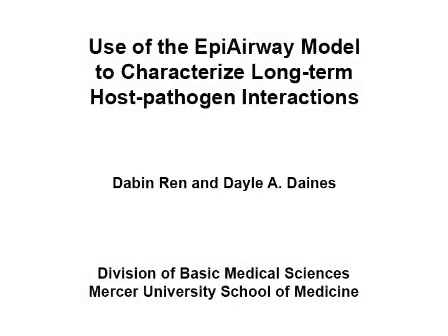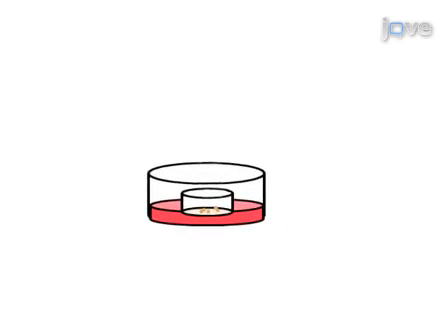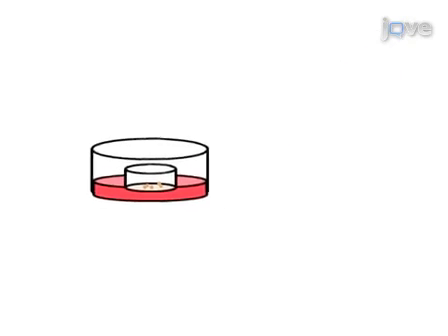The overall goal of the following experiment is to perform long-term co-culture of non-typable Haemophilus influenzae, or NTHI, with primary human respiratory epithelial tissues using the EpiAirway model. This is achieved by inoculating the apical surface with NTHI to allow the bacteria to adhere to and enter the tissues. As a second step, the inserts are washed every 24 hours with pre-warmed DPBS to mimic normal mucus flow and to remove mucin, waste products, and any cellular debris.